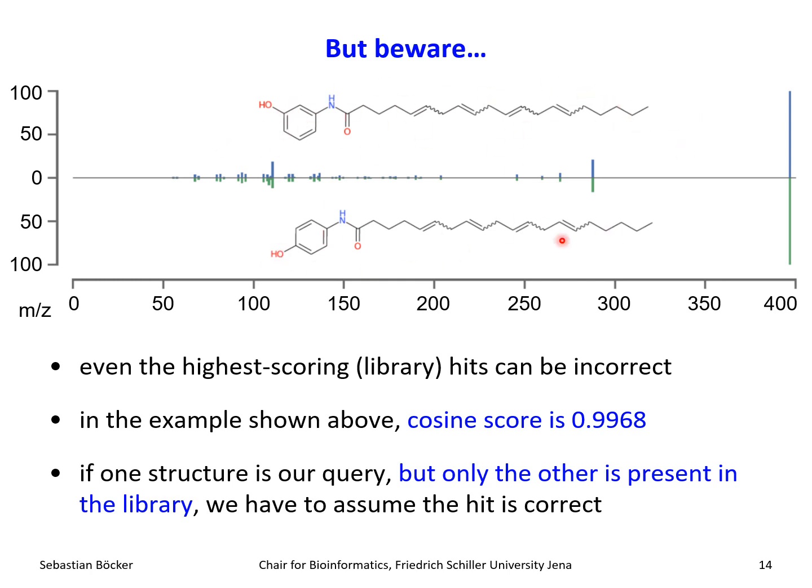But our spectral library or our structure database contains data for this similar structure. What will happen? Well, we will put that in as a query, and we'll see that those spectra are an almost perfect hit. The cosine score, if we leave out the precursor peak, is above 0.99. So we would almost definitely say this is correct.